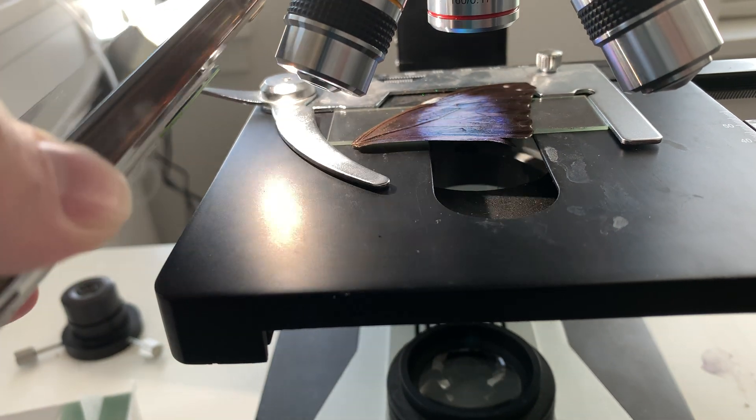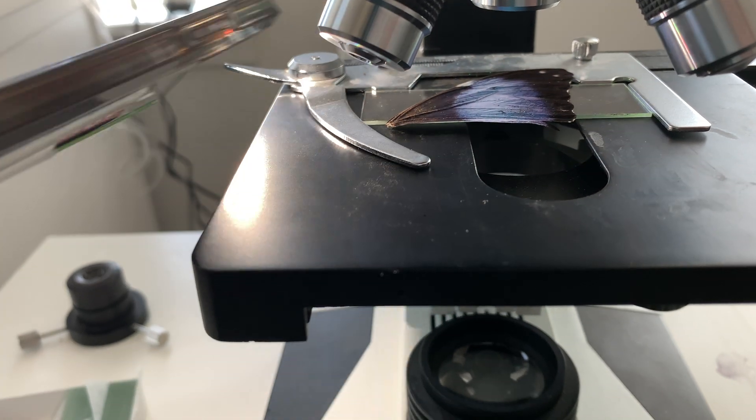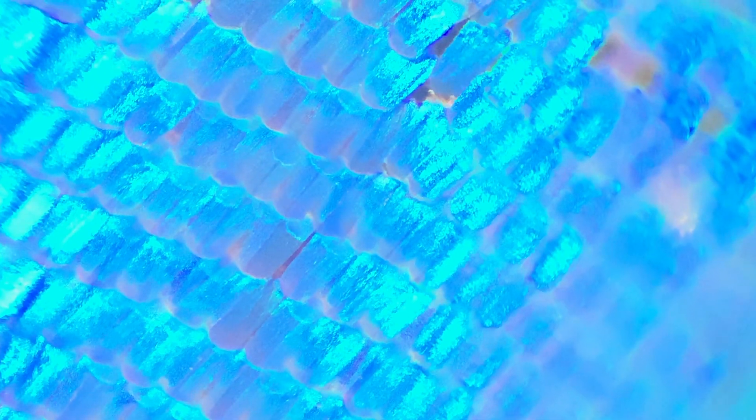Now I also wanted to do another fun thing with some lighting. So you'll see I'm kind of moving my wife's phone back and forth with her camera light — not too professional, but it still gets the job done. So here are the wings under the microscope, and I'm going to be adjusting the light by just moving the phone around a lot. I'm also going to be adjusting the focus as well. Pretty much for the rest of this video, that's just going to be it — me adjusting the focus and light of these different butterfly wings. There's pretty much nothing else to say, so I'll just let you guys enjoy this for a little bit.